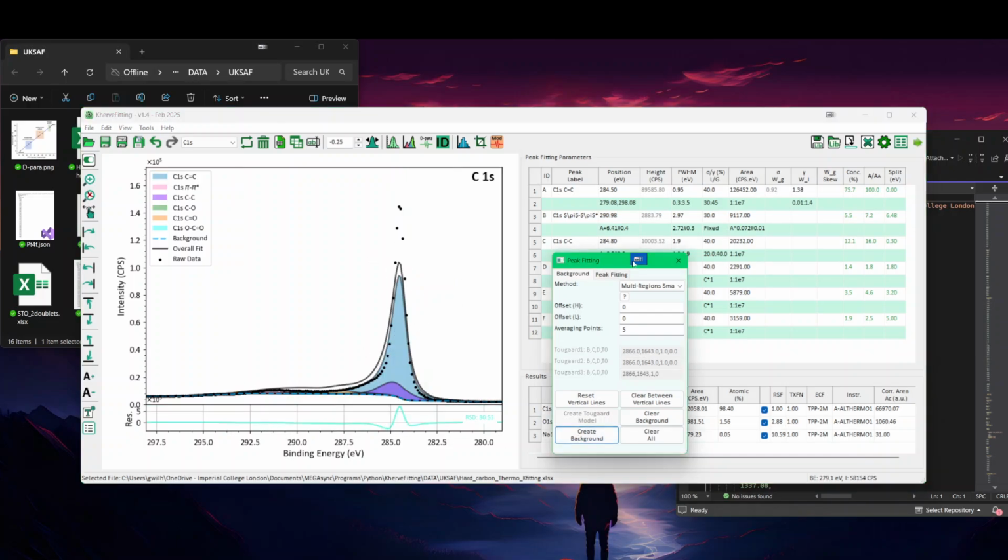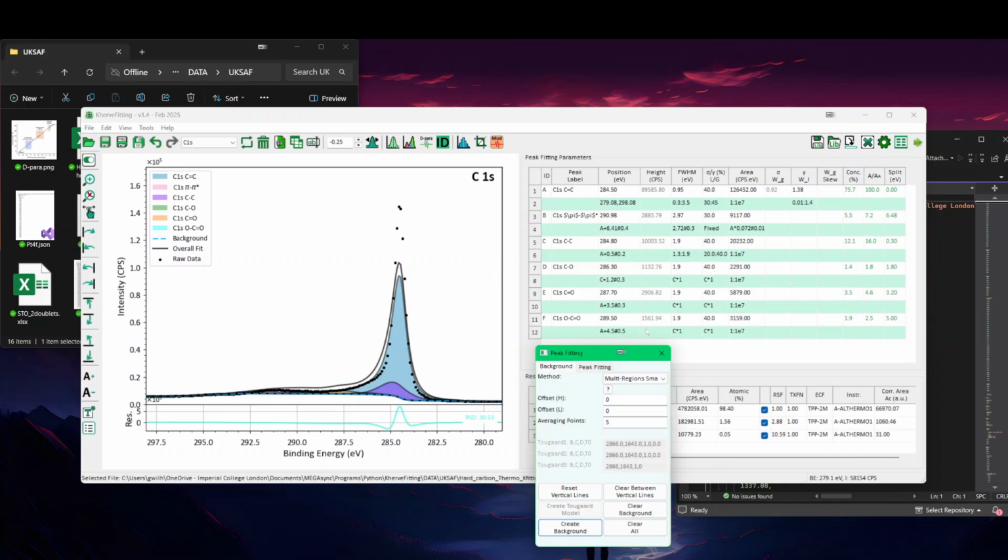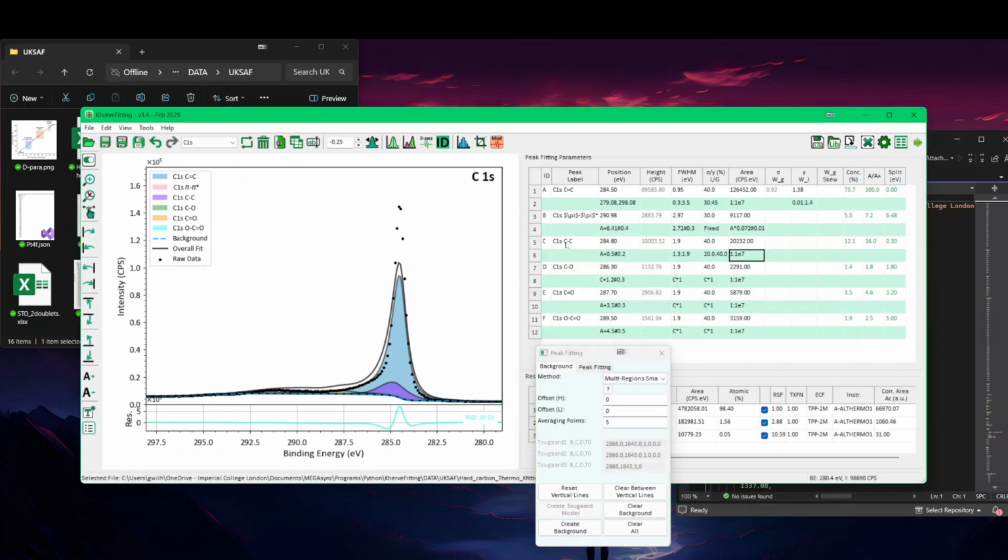Okay, so that's done like this, but I found, before I start fitting, that I had 22.6 in my parameters. That means extremely sp2. So I can already make C-C, or single bond C, as a function of C double bond C. That will be something like A times 0.1, so maybe less than 10%, or even less than 5% sp3. So I put that in, and let's see if it fits.